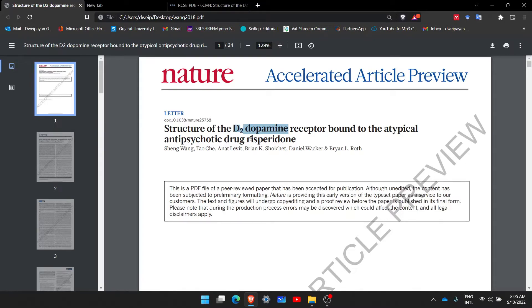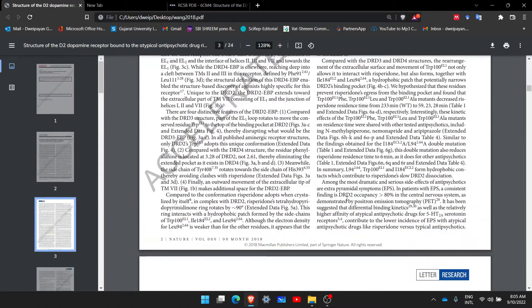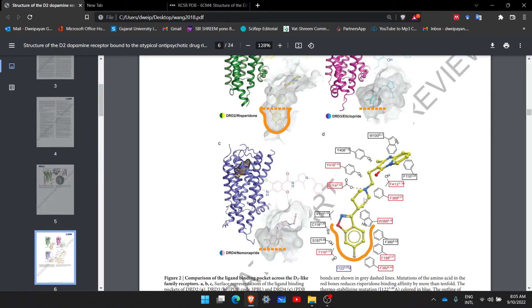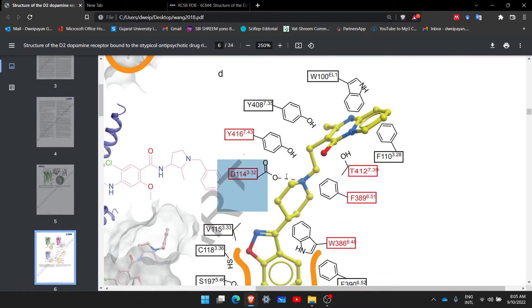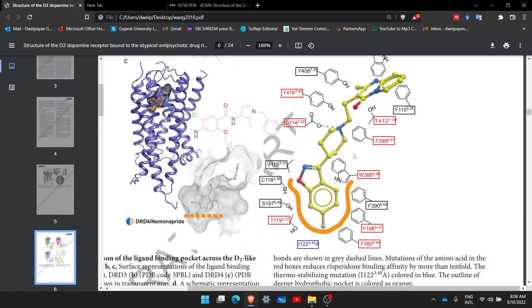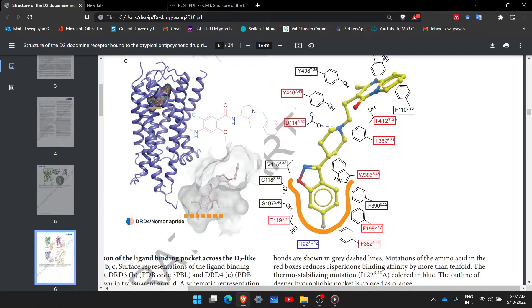For the D2 dopamine receptor to interact with risperidone, as you scroll down you will come to know that the amino acid interaction taking place with aspartate 114 is considered to be very important. Aspartate D114 — where 114 is the number of the amino acid — is a key residue. If you replace this amino acid, what will happen to this protein is the question we are concerned with. We want to manually edit this protein and modify its activity by replacing aspartate.